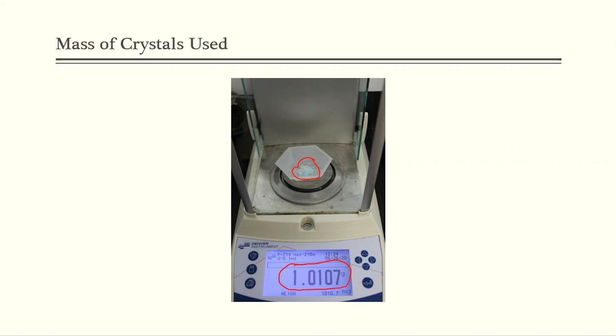1.0107 grams. That is the mass of the starting benzoic acid that is contaminated. And once again, I can see that bluish tinge that's in the benzoic acid. I know it's not supposed to be there, and I know that we have to get rid of it.